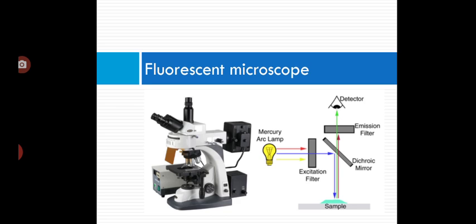Fluorescence is a phenomenon that occurs when an object is impacted by a given wavelength of light and emits light at a wavelength longer than the one to which it is exposed. Most cellular components are colorless and cannot be clearly distinguished under a microscope. The basic premise of fluorescence microscopy is to stain the component with dyes.